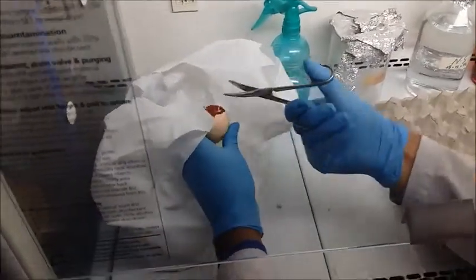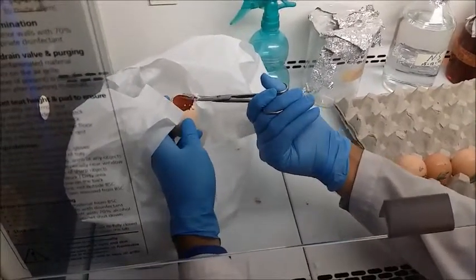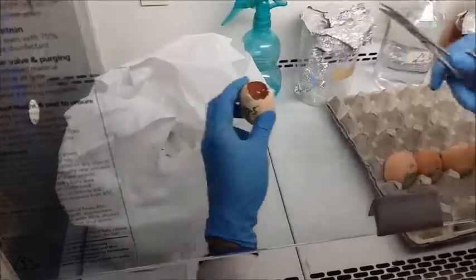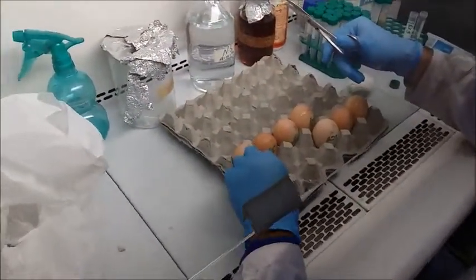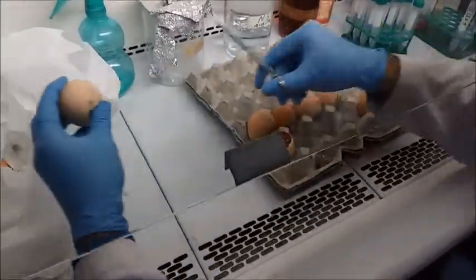Make sure that you do not disturb the inner contents of the egg. Once you have cut out a portion of the egg that you are comfortable with, you can move on to drawing out the harvested fluid.